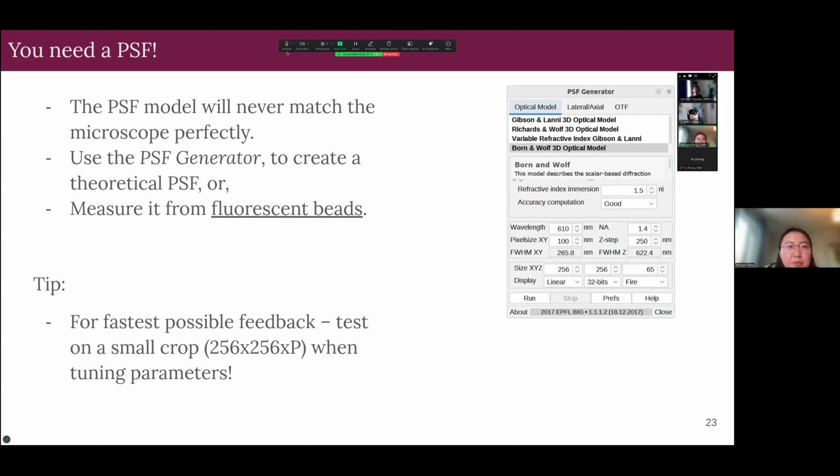There is an area scan deconvolution processing, and because my cell has a background under some dots, after the deconvolution I saw a lot of worm-like stuff in the background. I'm wondering if it is because of my background or I have too few iterations.